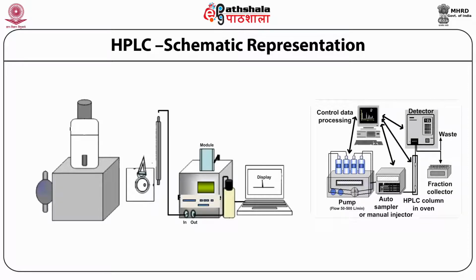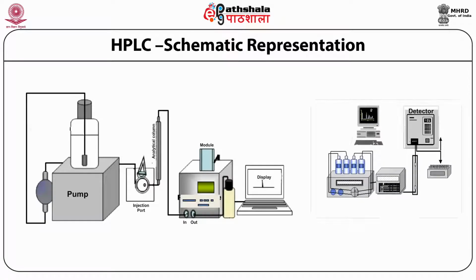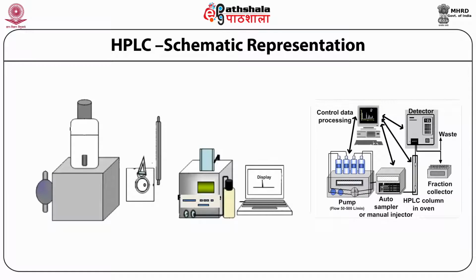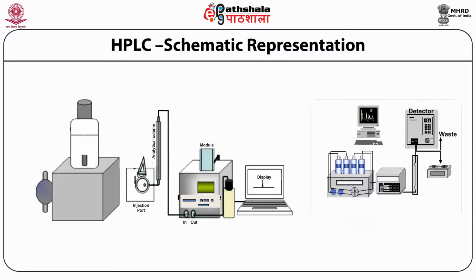The compound which has higher affinity towards the stationary phase stays more time in the column. The one which has a low affinity for the stationary phase elutes first. So in a typical C18 column, when you run benzene and acetone, acetone comes first and then benzene, for a mobile phase of 1:1 acetonitrile-water or methanol-water. When they come out, they should be identified by using a detector.